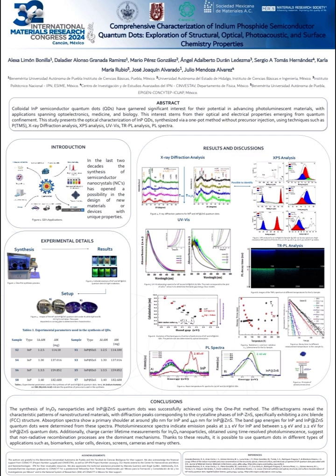About the experimental details, our synthesis was a one-pot method in which we put all the precursors in one phase, but for each sample, the amount of myristic acid was increased, as we can see in Table 1. After the synthesis, we obtain our colloidal quantum dots, which we can see in Figure 3 under UV light, highlighting their photoluminescence. For the last step, our setup, we deposit the quantum dots on Corning glass to determine their characteristics.